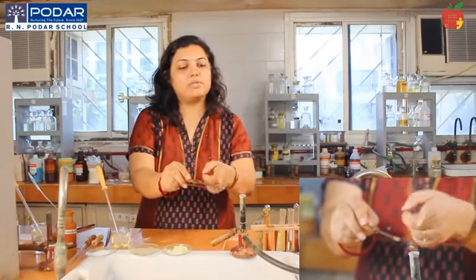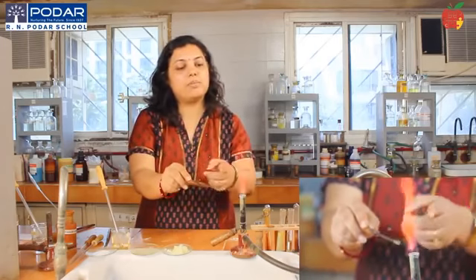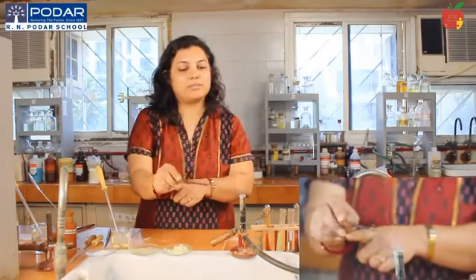Now you can see the beautiful color which has been imparted to the flame, by which you can detect your calcium, which is your brick red. This is your brick red color. Fine. So brick red coloration to the flame will indicate calcium.